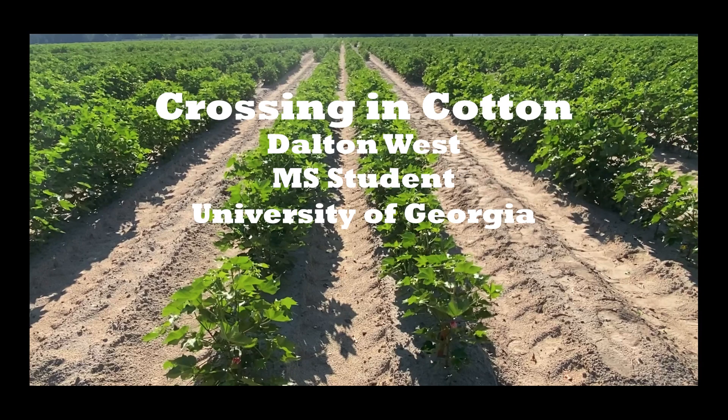Hello, my name is Dalton West and I'm a master student here at the University of Georgia working in the Cotton Molecular Breeding Lab located in Tifton, Georgia. Today I'm going to show you how to form a cross between cotton plants.